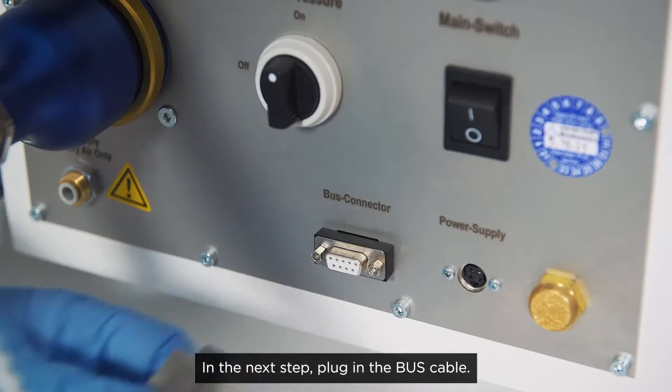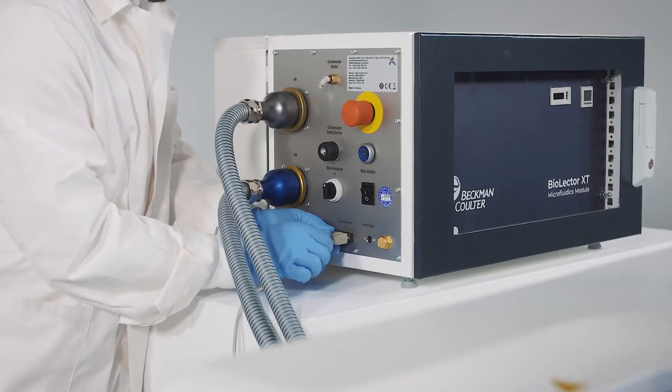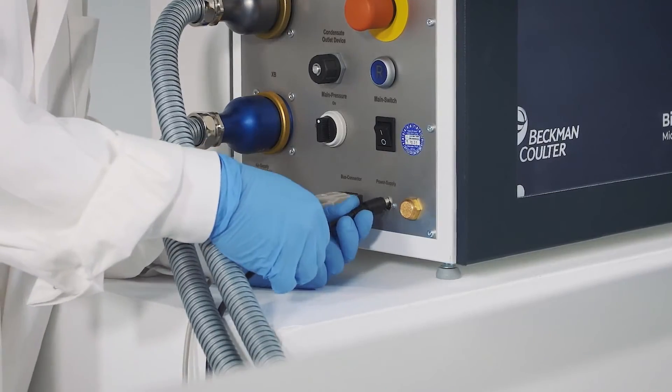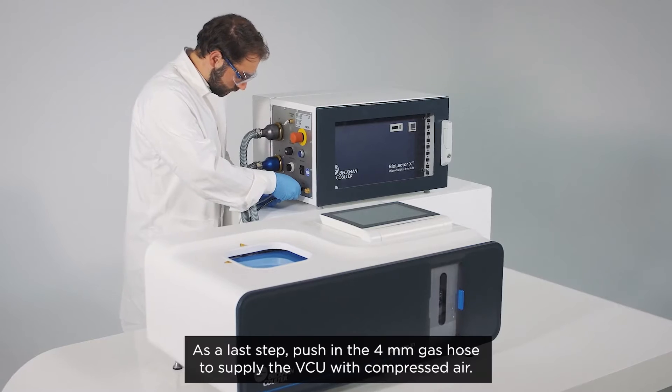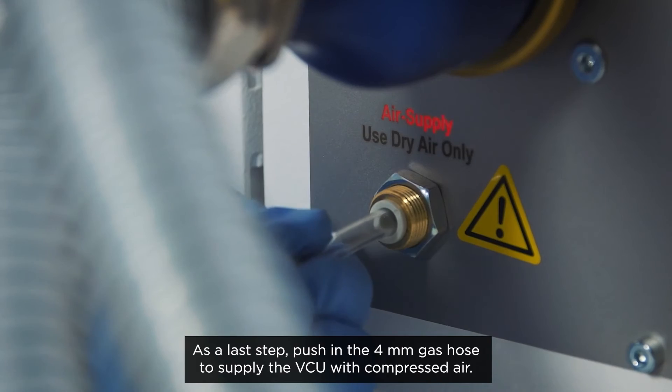In the next step, plug in the bus cable. Connect the VCU to its power supply. As a last step, push in the 4 millimeter gas hose to supply the VCU with compressed air.